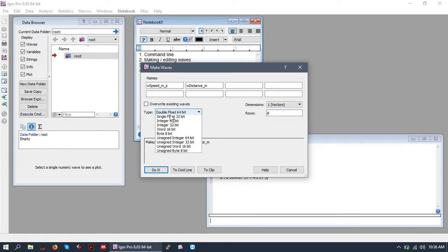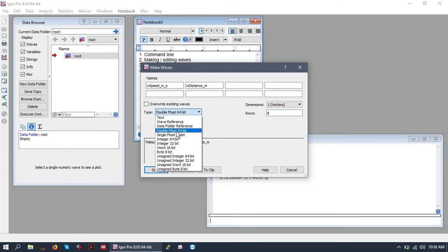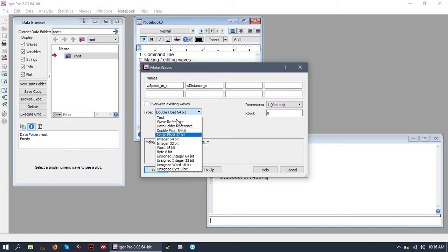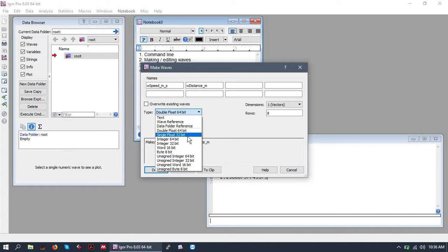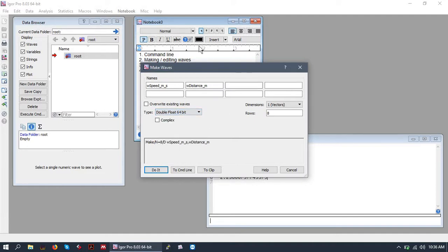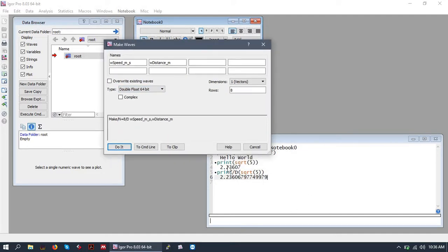Generally, I always make my waves double float 64-bit. You probably will only, well, generally, for most needs, you will only either need a text wave, a double float wave, or a 32-bit wave. The difference between a double float and a single float is the precision of the numbers in that wave.